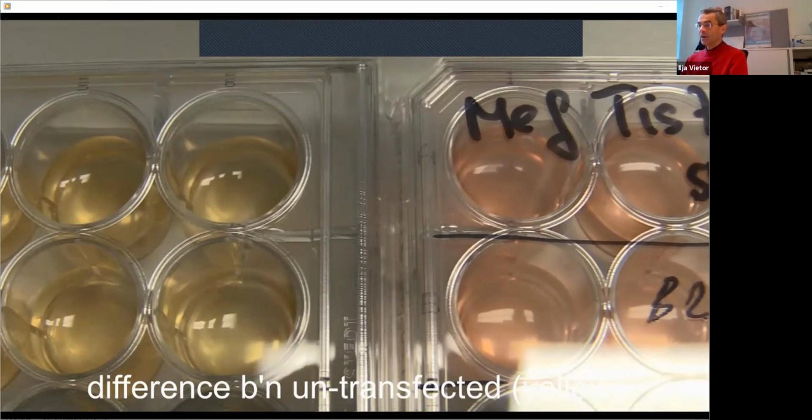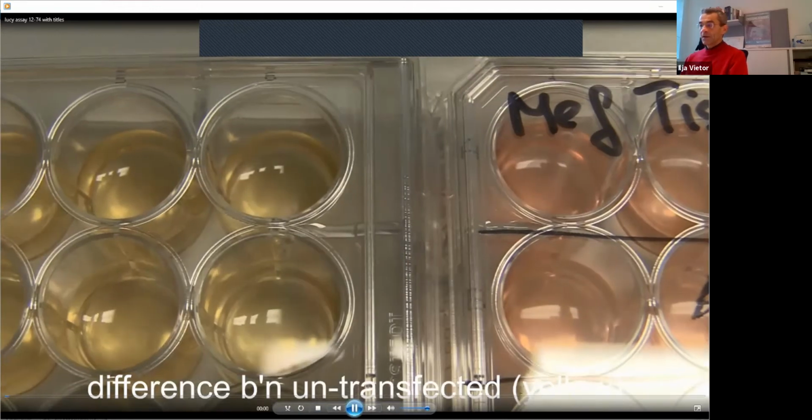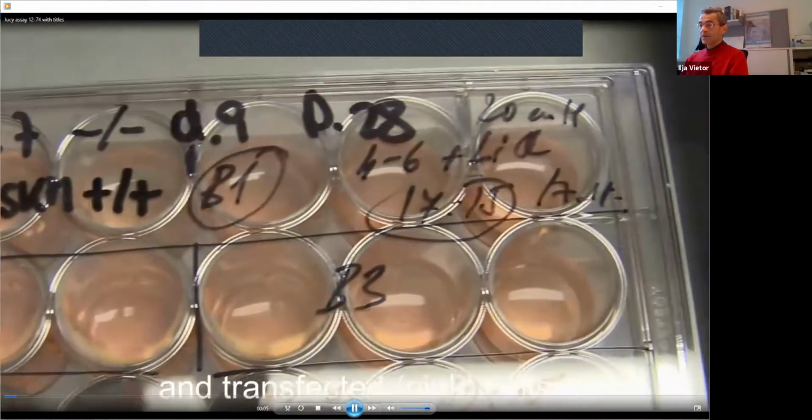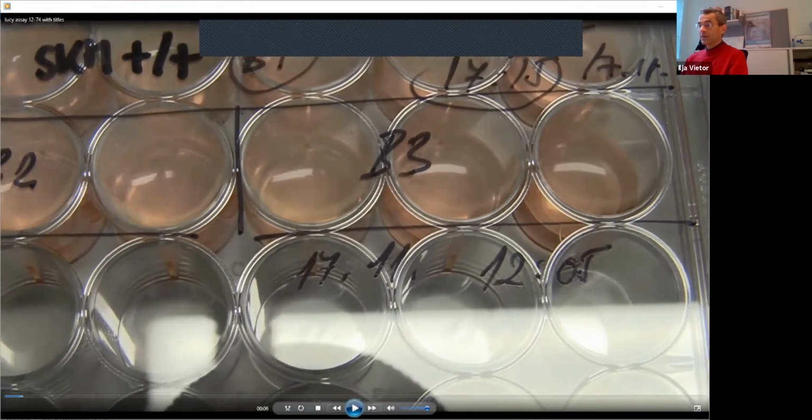Color of the medium, correct. Yellow color means that cells are growing fast. They are certainly overgrown. This pinkish red color means that it's alkaline, meaning that they are not growing so fast. So there is an effect of the transfection, something happened with the cells. This is the plate which was transfected. Next thing is that here the lithium chloride was added 1 day later.